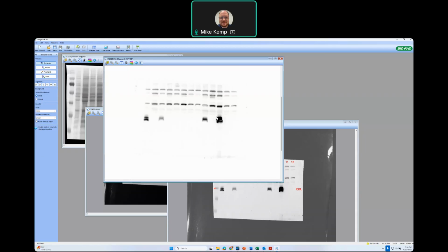So what I typically do is draw a box around whatever the biggest sample is. So this one looks like it's the most intense, this one over on the left or on the right here. So I'm going to draw a box, and I'm really going to start on number 1. So I'm going to basically copy and paste this on every sample. Again, some of these lanes don't have a band, or the band looks like it's missing, and that was really the goal of the experiment, was to generate cells that don't express XPA. So copy and paste all these along for every lane of the membrane.